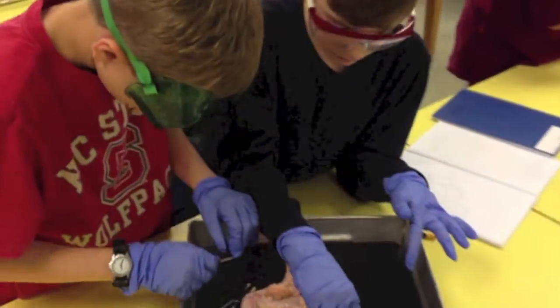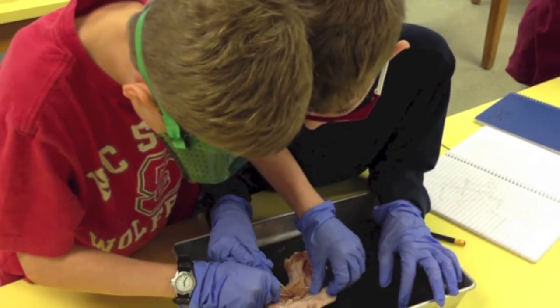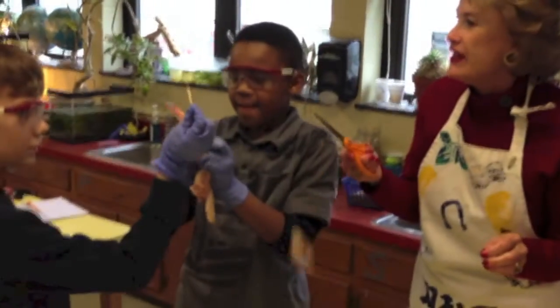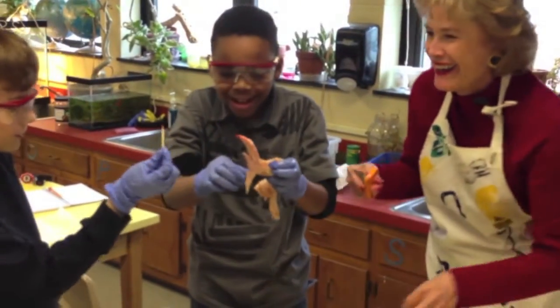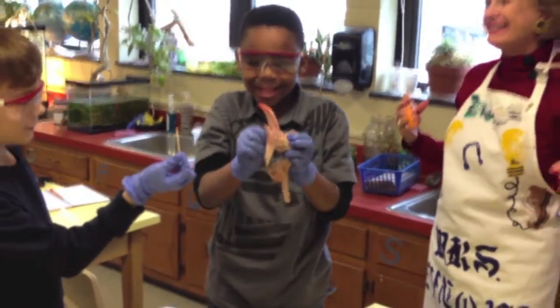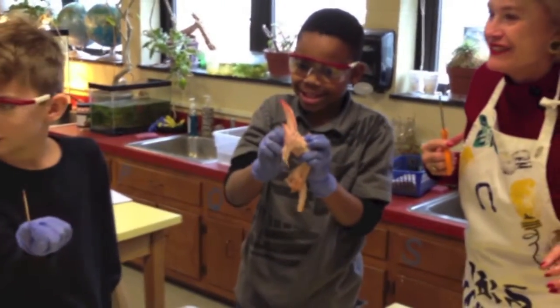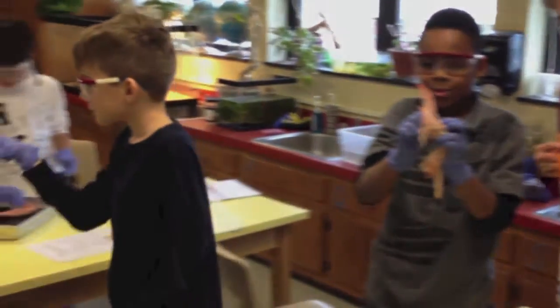What are you looking for? Bone marrow. It's right in here. Look at that bone marrow — he got the bone marrow. Excellent, Grayson! Grayson, let me see. Here, let's find it.